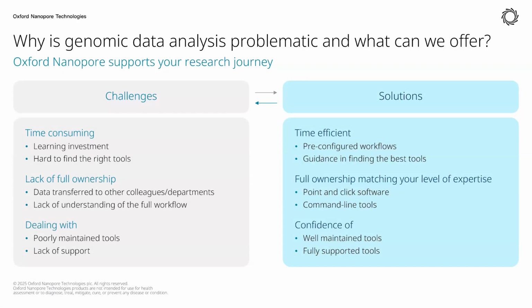Today, I'm gonna start with the data analysis part, how we can handle all the files which are generated out of our sequencing platform. For your context, it is P2 Solo, and the data you will be dealing with mostly, or in the recent future, would be cfDNA sequencing related data.